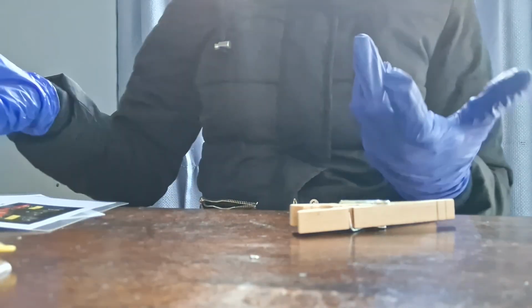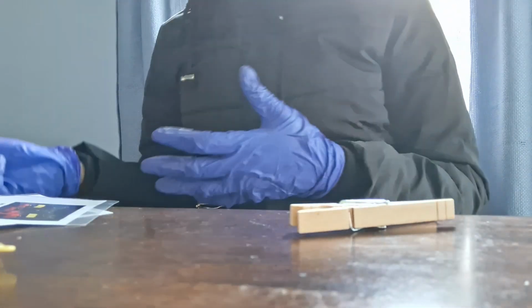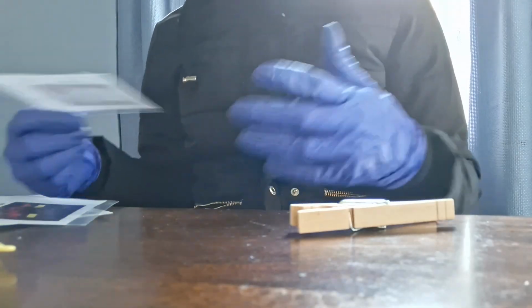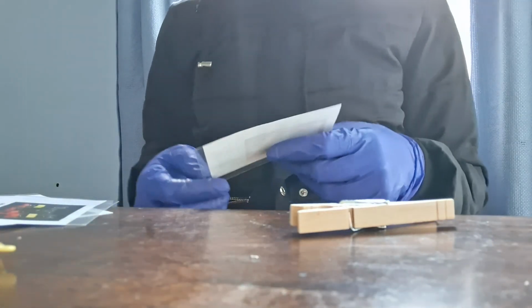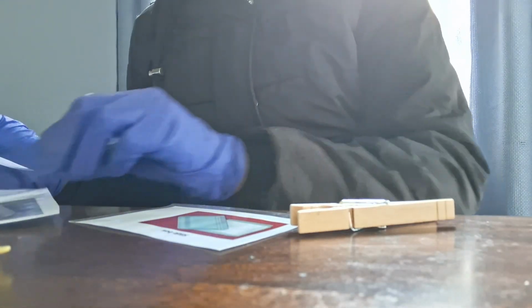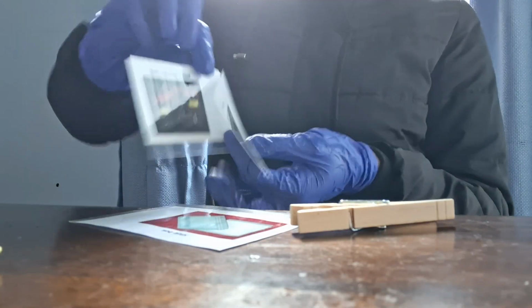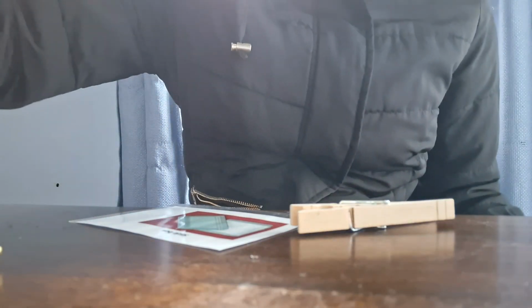Before we pack it all up, if we were not done, we would have placed it in the slide box, or put it under the microscope, from scanning to high power and then using the immersion oil to view whatever was done. But since we are done with it, we put it in the sharps container, and after we put the staining tray water into the stain collecting vessel, that will be it.